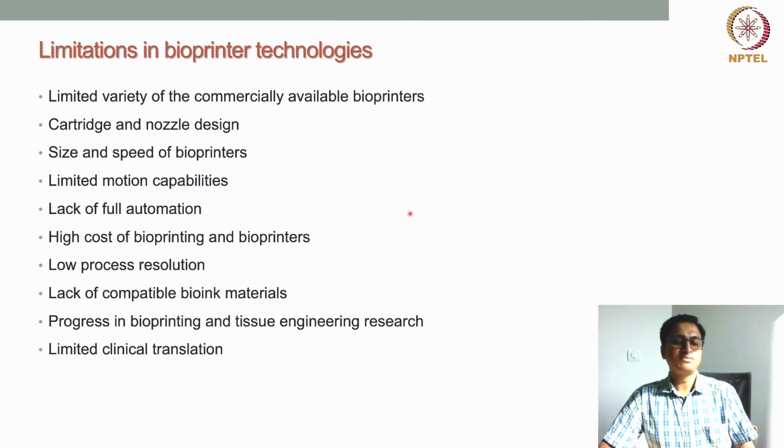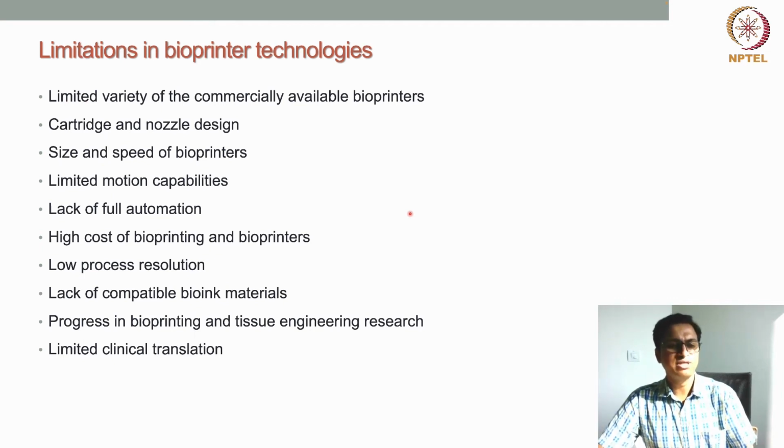The other thing is that for most bioprinters the resolution is not very high, except for inkjet and laser-assisted bioprinting. The resolution is not that high with extrusion-based bioprinting. So resolution is also another factor that can be improved further.